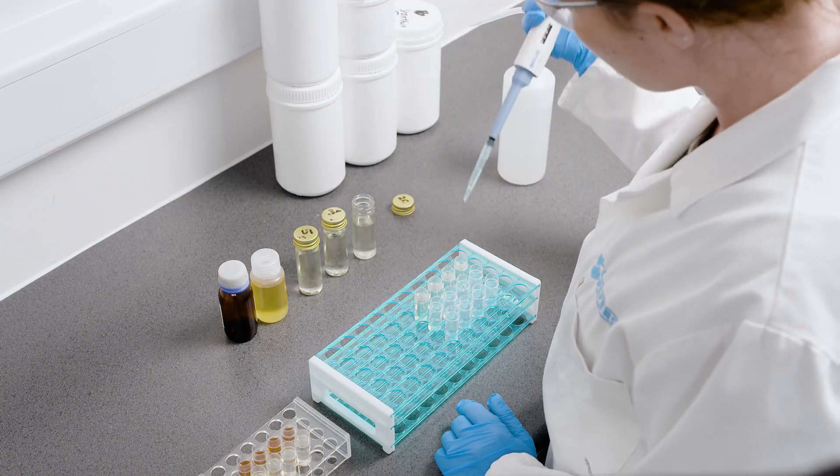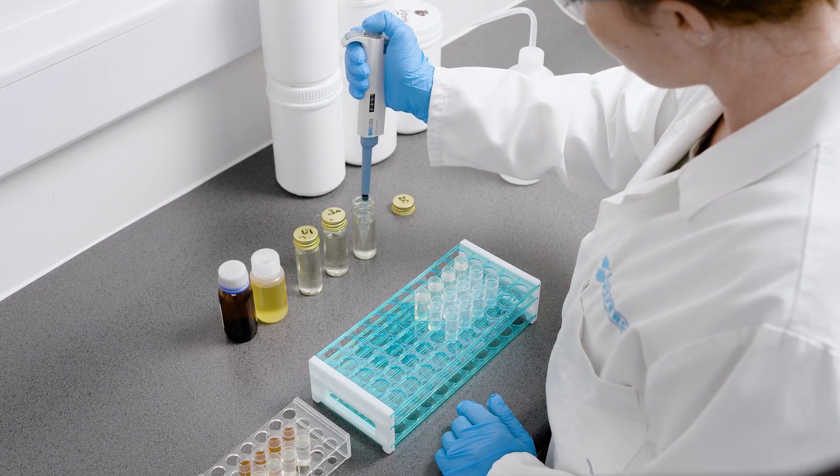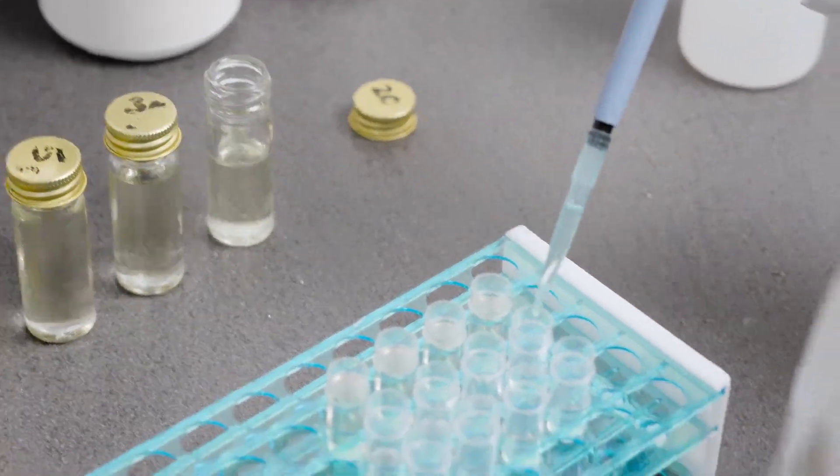Analysis is carried out to ensure these limits are not exceeded, and the sampling and test procedure is controlled by legislation in many countries.